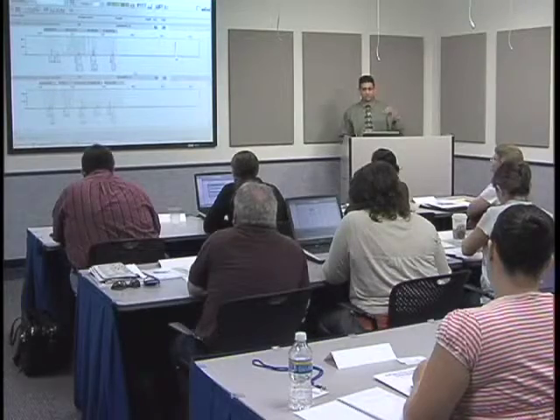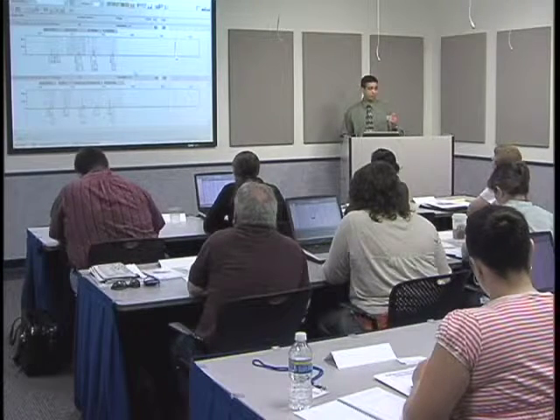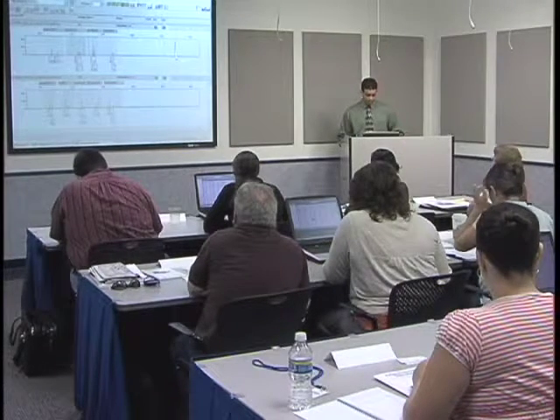And that one doesn't look, see CSF is not really that high. I'd have to compare it to the original data to see where CSF was in the original data. And that's something we can give you the data for, and if you wanted to go home and look at what the original CSF was, maybe it was very low, into the baseline. Maybe it appears to be dropout, and so it only increased a little bit.